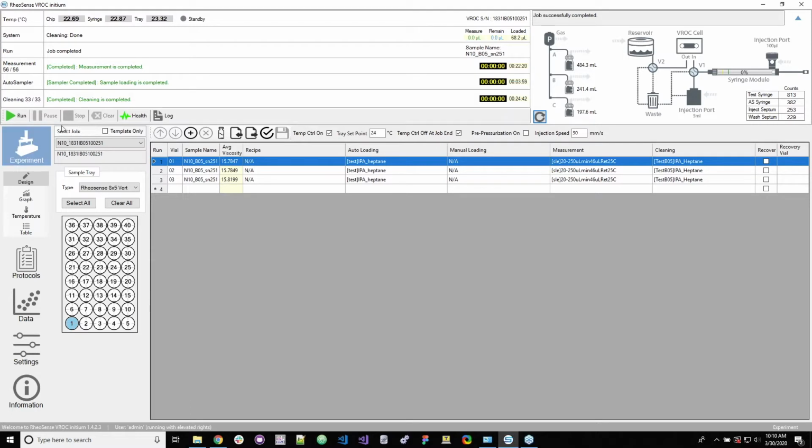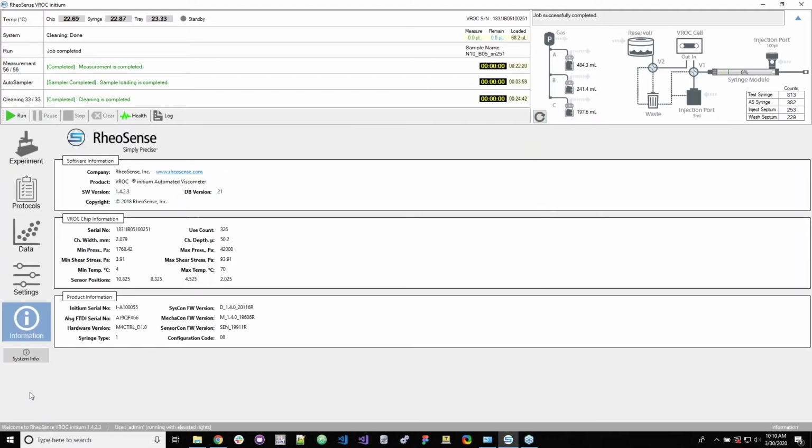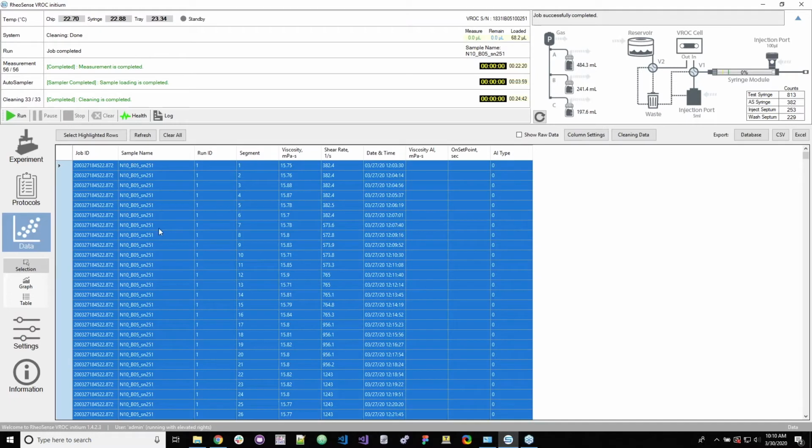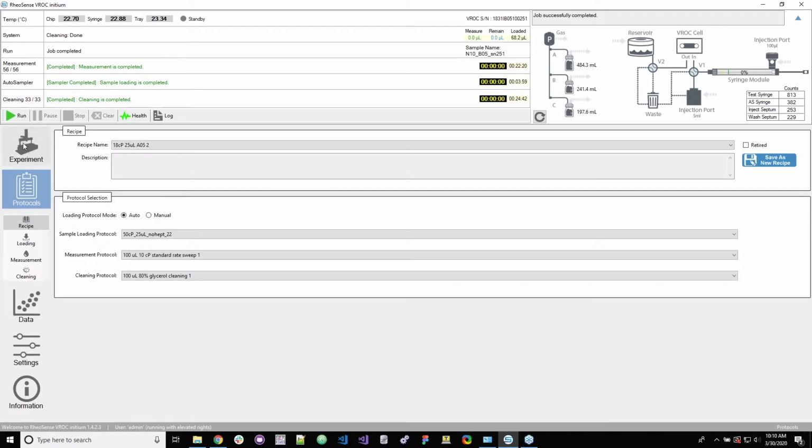All right, so now we can look at this big space here for some more information. So right now we have the experiment tab selected. So we have the experiment tab, the protocols tab, the data tab, settings, and information tabs. Just to show you how it filters through each of these. So we have the information tab that will tell you the information, and the settings tab that will tell you a lot of information about the usage counts and user accounts, and then some service utilities. And I'll go through each of these steps later in this demo. And here's the data tab, protocols tab, and back to the experiment tab.